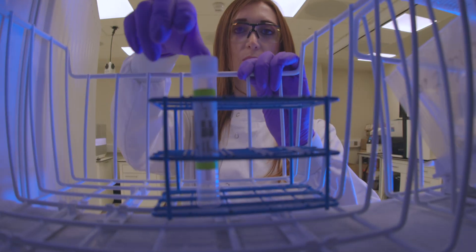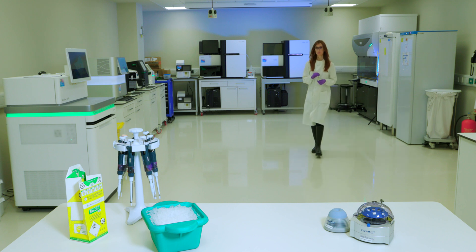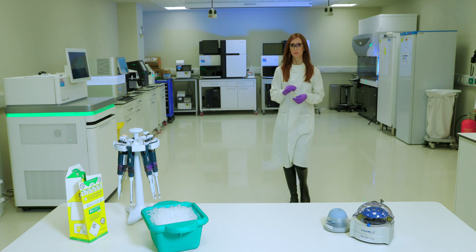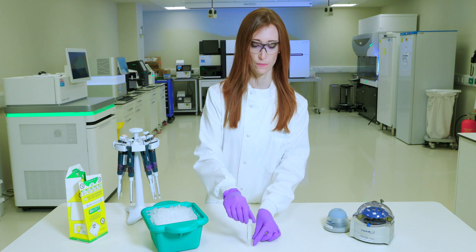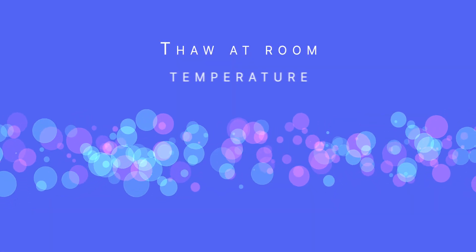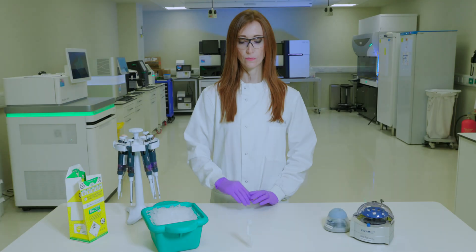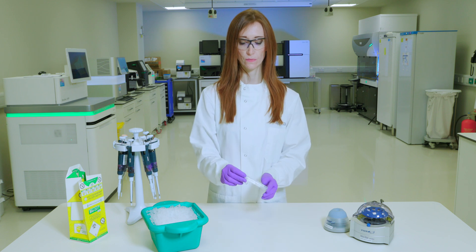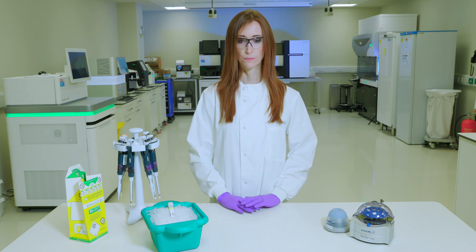Remove HT1 from minus 25 to minus 15 degrees Celsius storage and thaw it at room temperature. After thawing, store the HT1 buffer at 2 to 8 degrees Celsius until you are ready to dilute the denatured libraries.